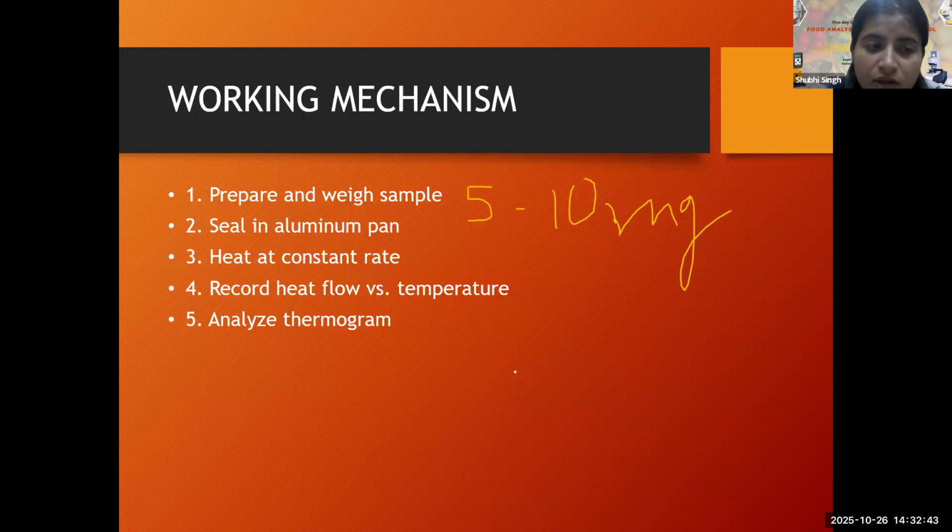From this we obtain a graph, the DSC thermogram, which shows the thermal transition of the sample. We record heat flow versus temperature and then analyze the thermogram. A thermogram is nothing but a graph like this.